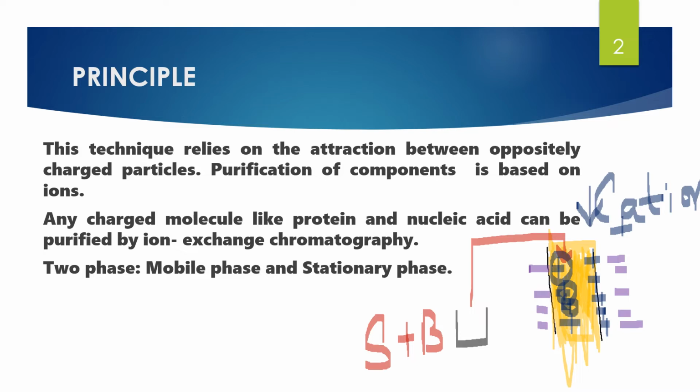So if this is a cation exchange chromatography, the strong cations which are present in the sample will replace these functional cations. The functional group cations will be eluted out from the column, which can be detected in the detector.